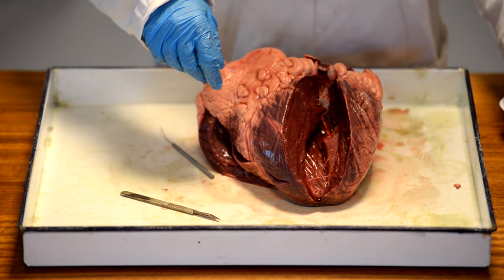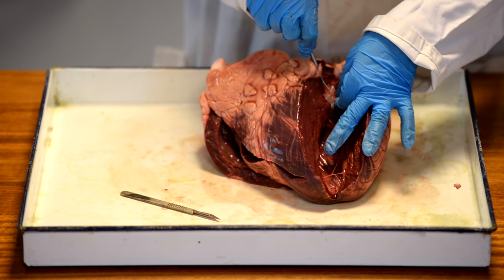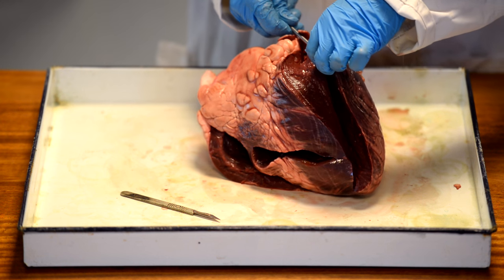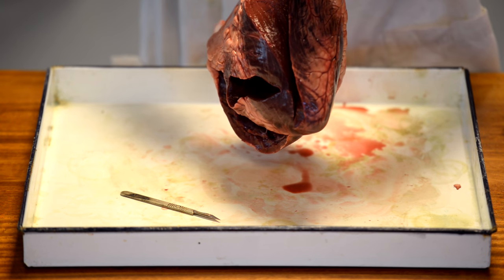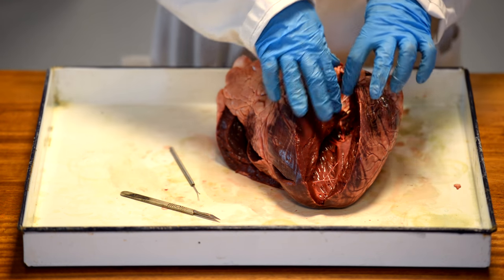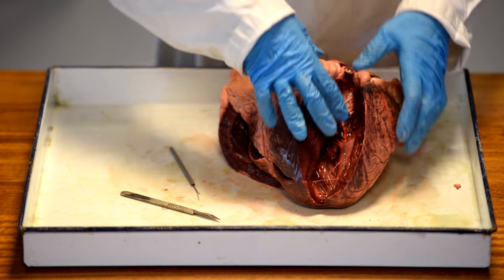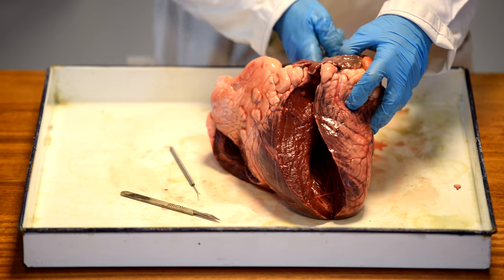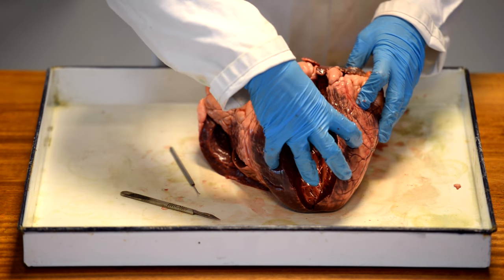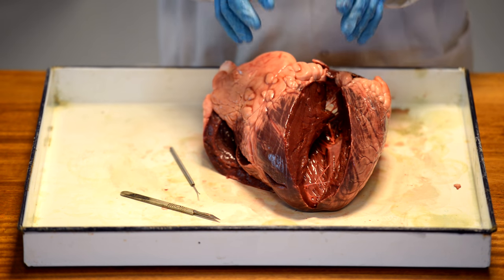In fact, they're so strong that if I take my mounted needle and take just one of these strings round the mounted needle, it is strong enough, something as thin as a piece of cotton, for me to hold the whole heart up on. Because when this heart beats, these are the only thing that are going to prevent the blood going the wrong way. So these are the strings that hold the valve that separates the left atria from the left ventricle. And you don't want the blood going the wrong way through the heart when the heart beats.